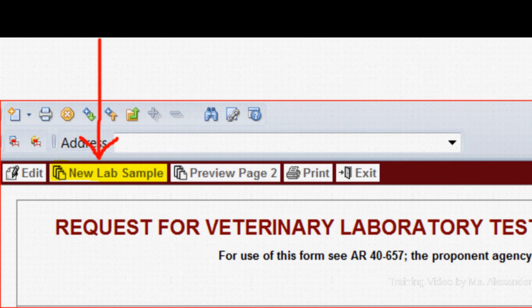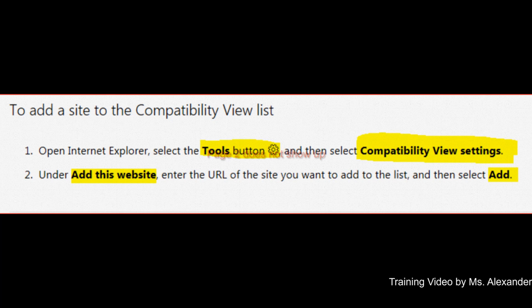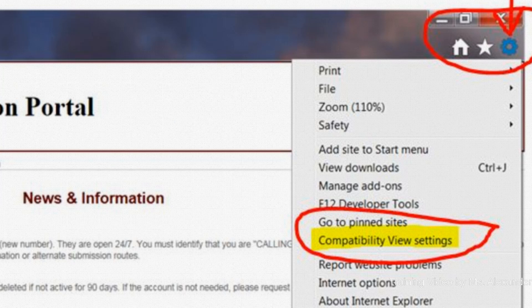Tips to remember when entering page 2 of the web version of the DA Form 7539 and the lab sample database is not working: make sure to check the compatibility view setting and try it again.